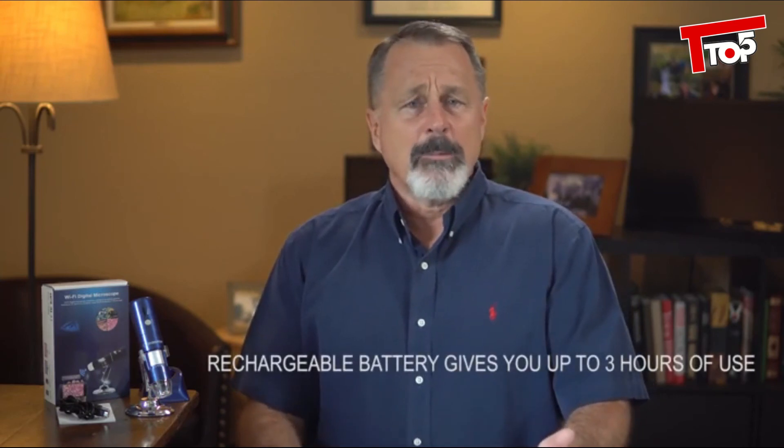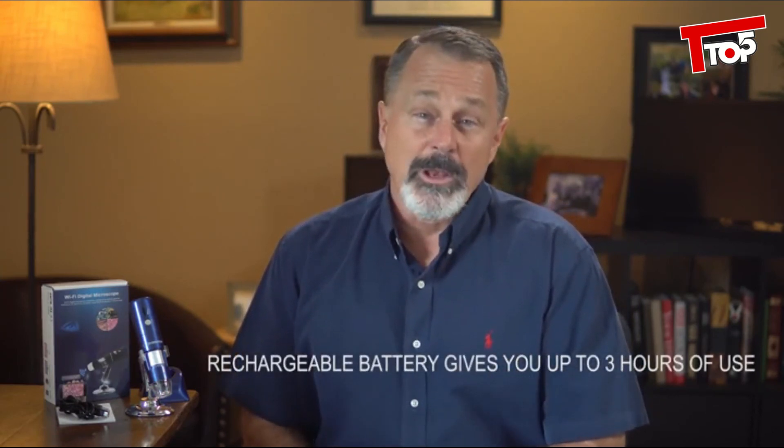Its rechargeable battery will give you up to three hours of fun and enjoyment with a full charge, so you can take it out and explore with the kids, or you can connect it to your computer with a USB cable. Whether you're a kid, a hobbyist, or a professional, you're going to love the Joy's Made microscope. Get yours today.